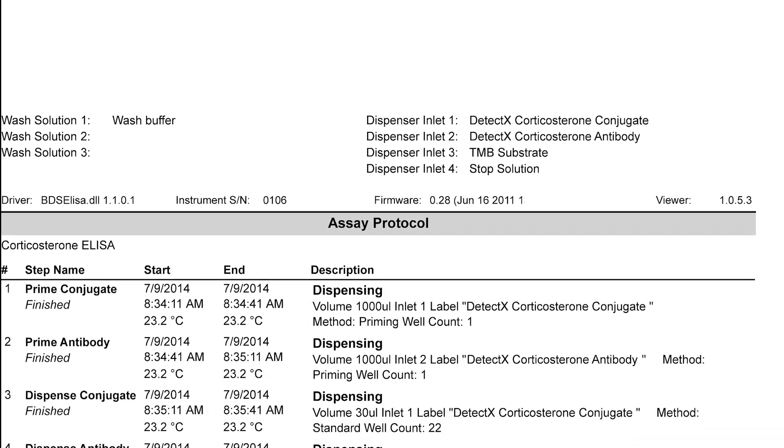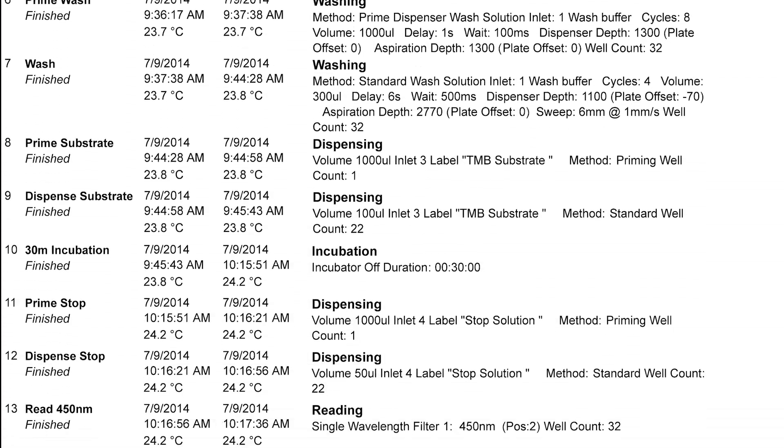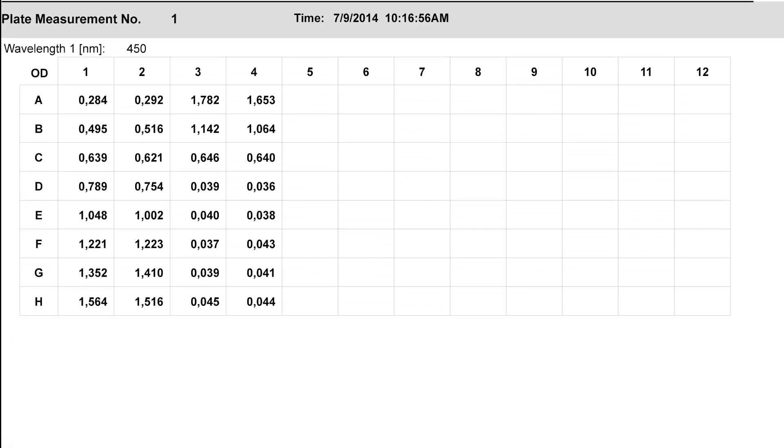The crocodile report viewer displays comprehensive assay results and information. Here we may observe the raw OD in a convenient plate layout display.